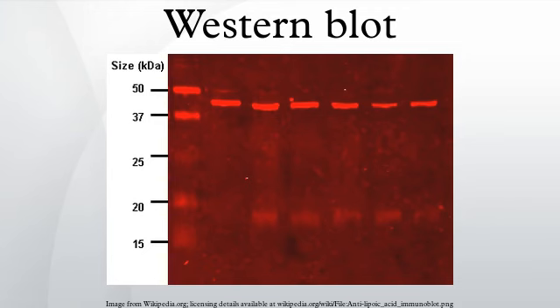An improved immunoblot method, Zestern analysis, is able to address this issue without the electrophoresis step, thus significantly improving the efficiency of protein analysis. There are now many reagent companies that specialize in providing antibodies against tens of thousands of different proteins. Commercial antibodies can be expensive, although the unbound antibody can be reused between experiments. This method is used in the fields of molecular biology, biochemistry, immunogenetics and other molecular biology disciplines.